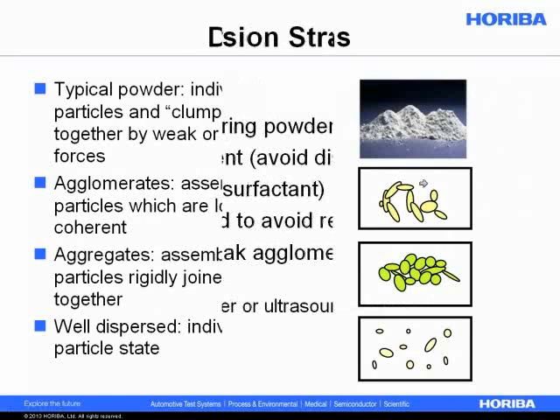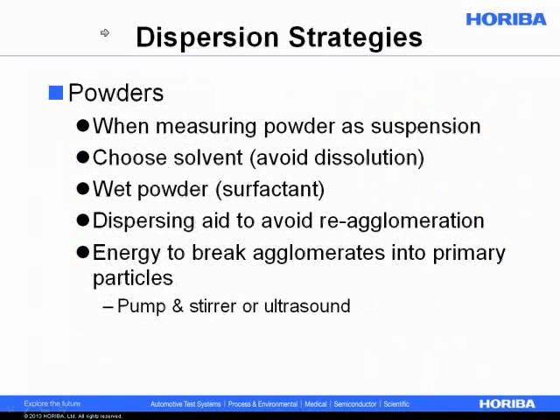Sorry, there we go. So what we're going to talk about is how we're going to disperse these powders. We could measure powders in a dry powder feeder. Then the dispersion would be just a question of how much energy we put into the system using the dry powder feeder. But if you want to suspend the powder in a liquid to do the measurement, that's the topic tonight that we'll be discussing.